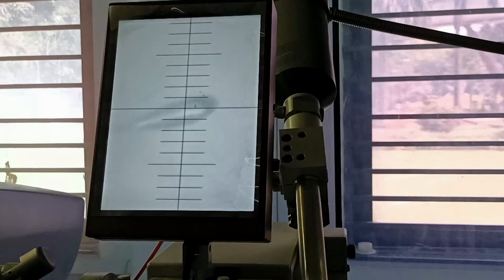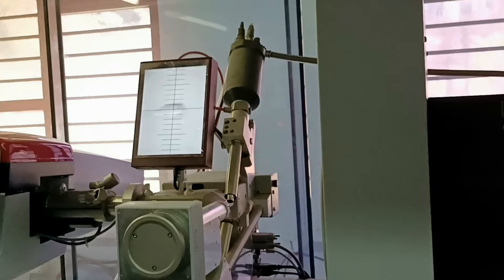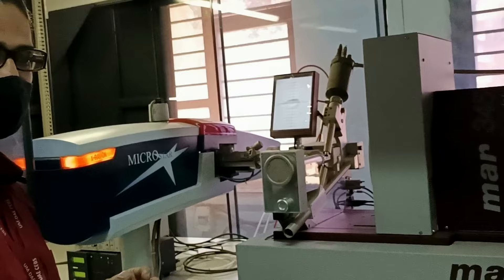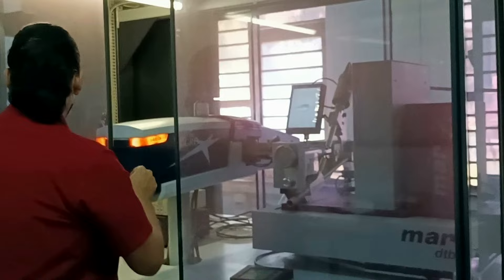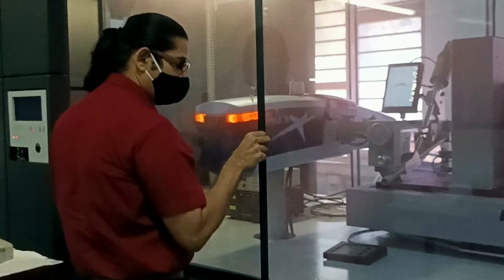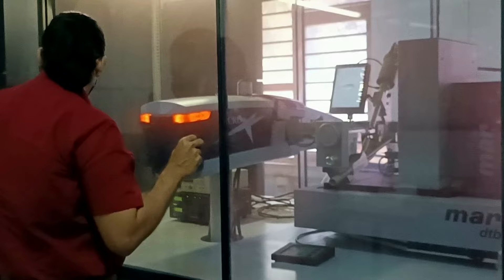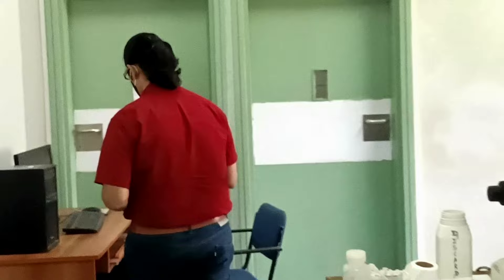The crystal is mounted and centered. Before I open the source, I have to close this lead panel — you don't want to be exposed to radiation. So we have this lead panel like this, and we close it. Now we are safe and good to go for the exposure.